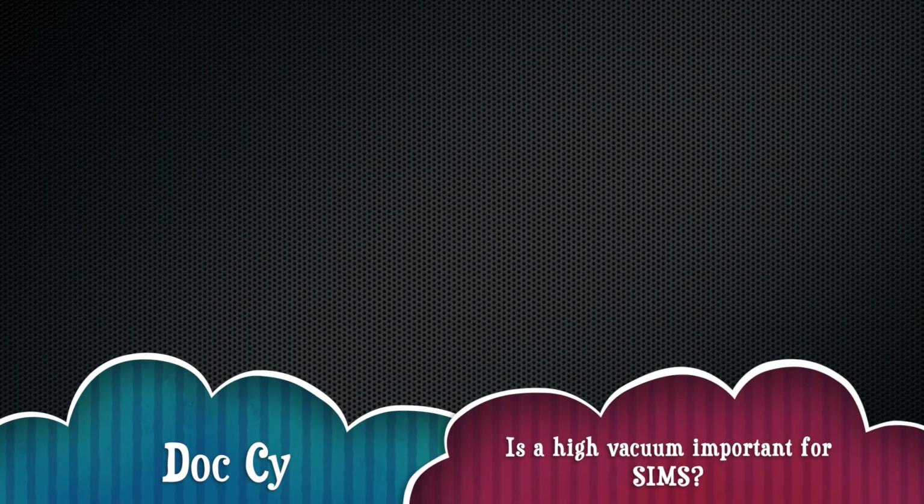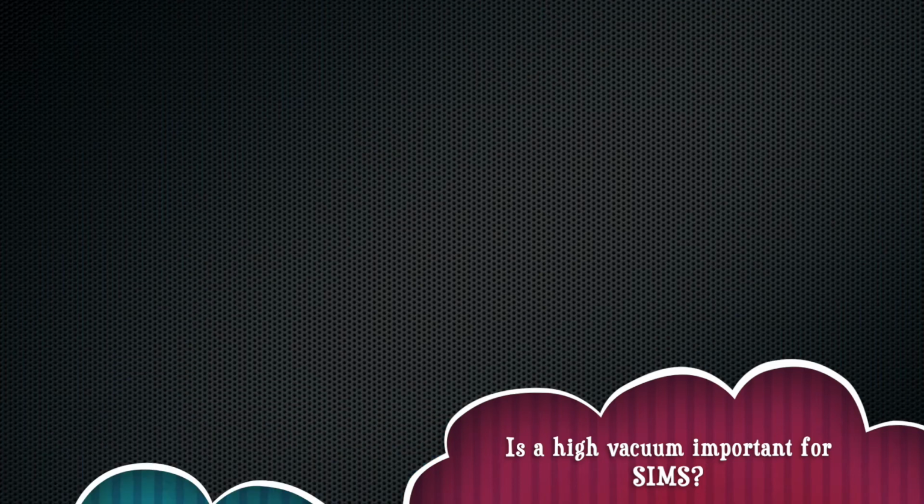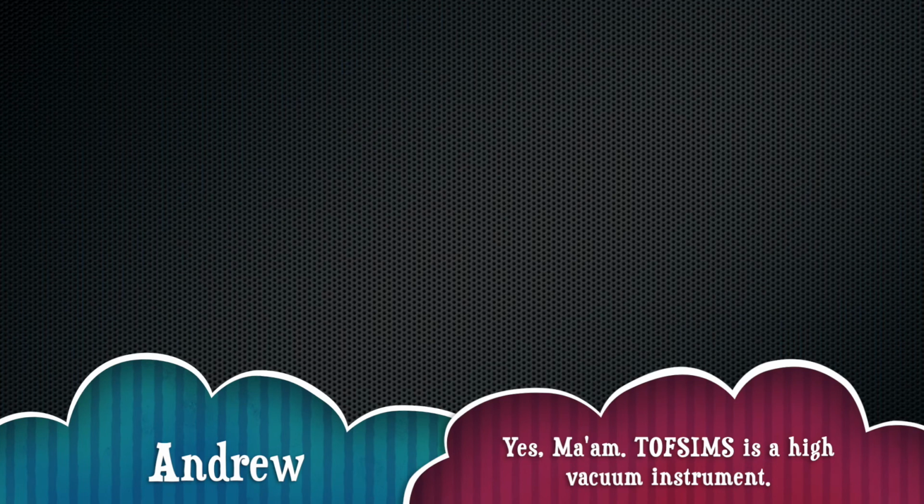Is a high vacuum important for SIMS? Yes, ma'am. TOF-SIMS is a high vacuum instrument, ma'am.